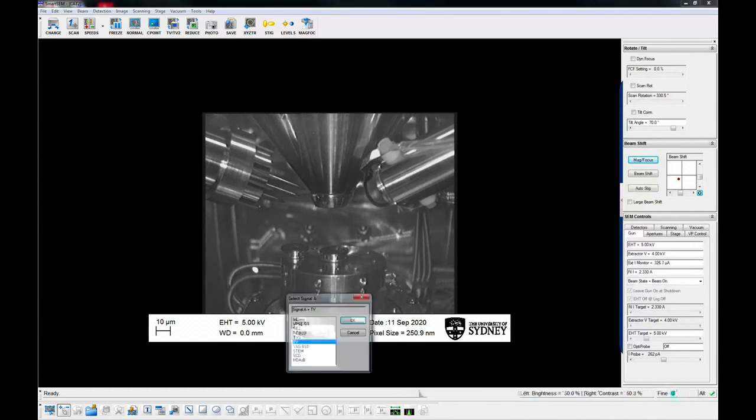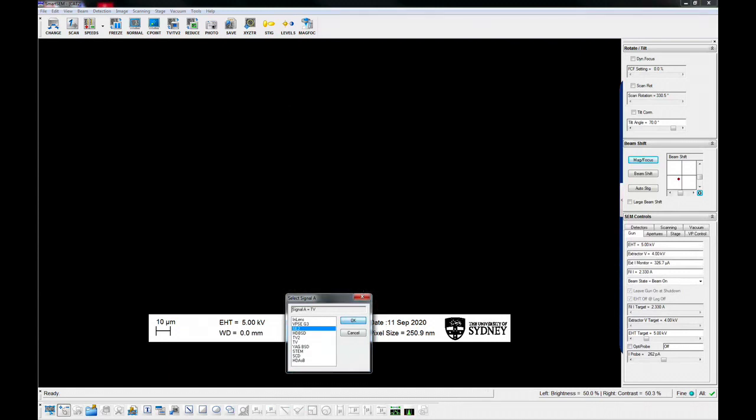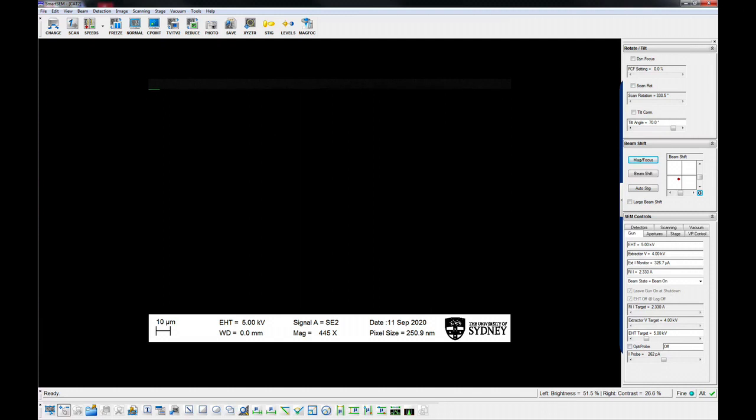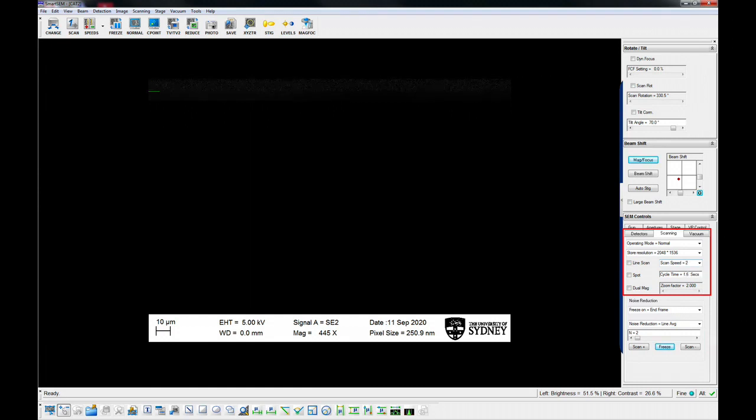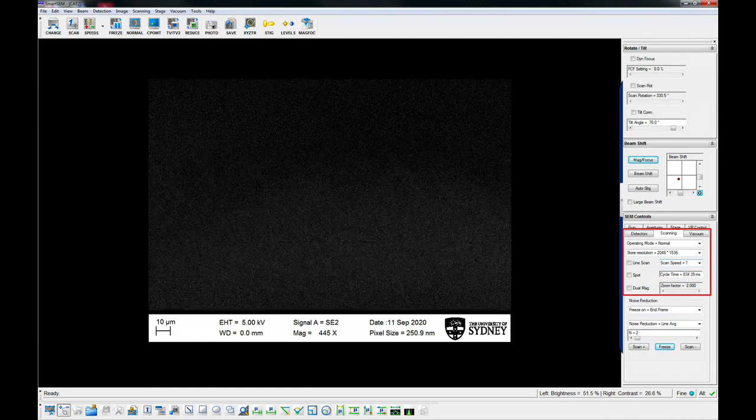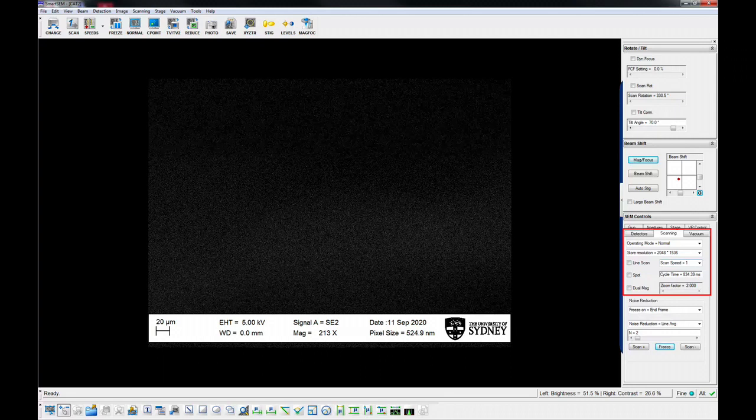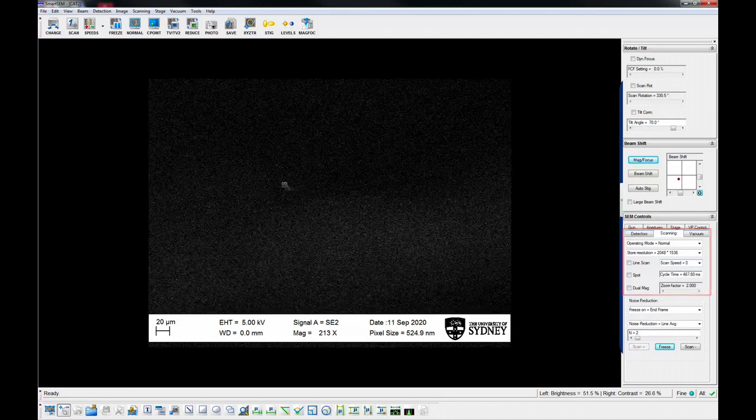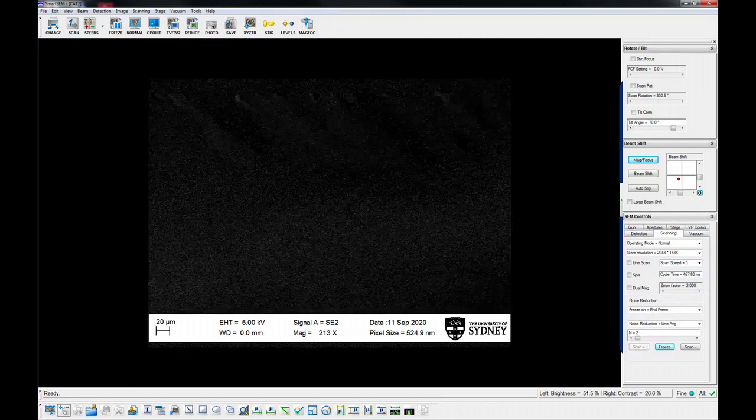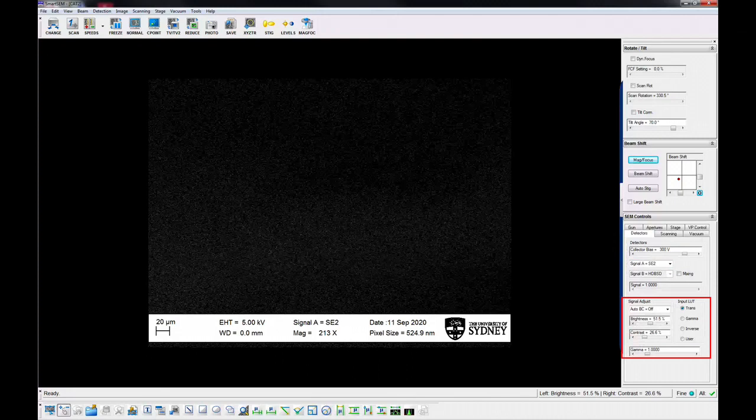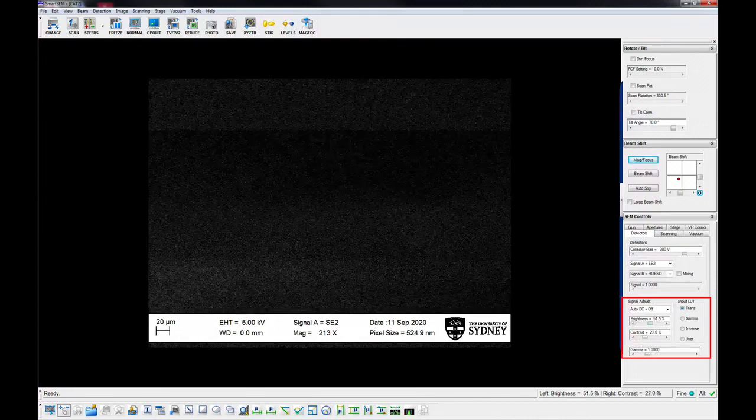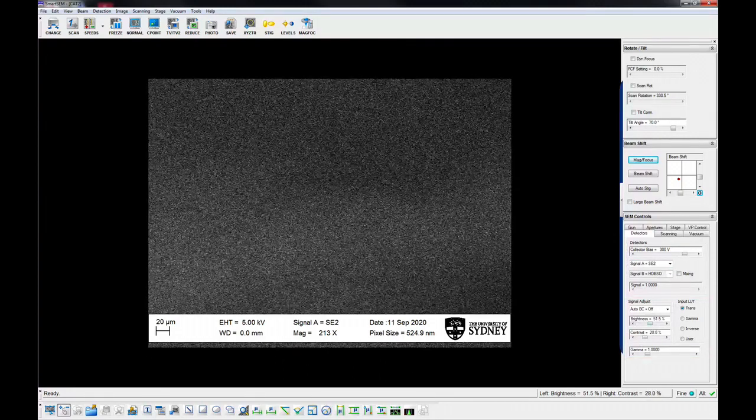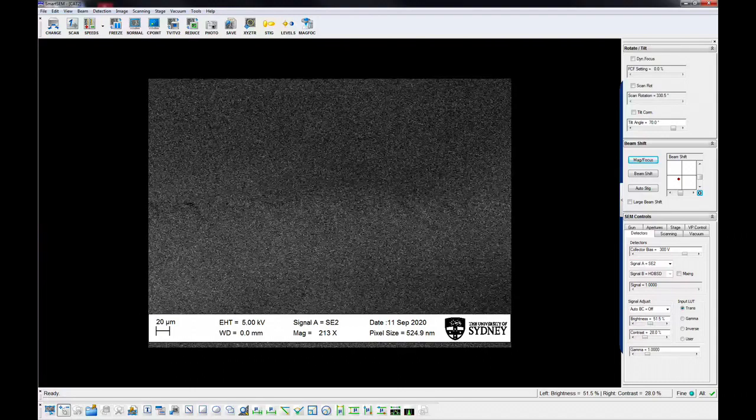Select the SE2 detector to start with and adjust the brightness and contrast. Decrease or increase the scan speed so that the frame rate is fast enough to see the changes as you adjust these settings. Adjust the brightness and contrast so that you can see some features on the screen, typically setting the brightness to around 50%.